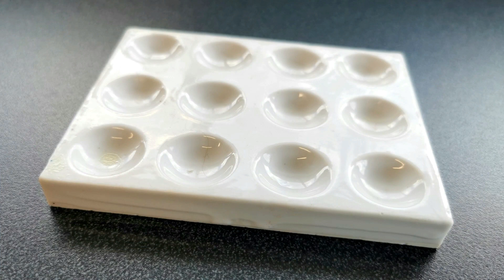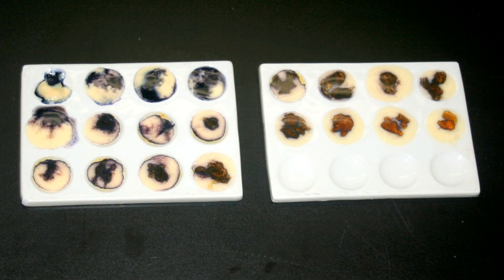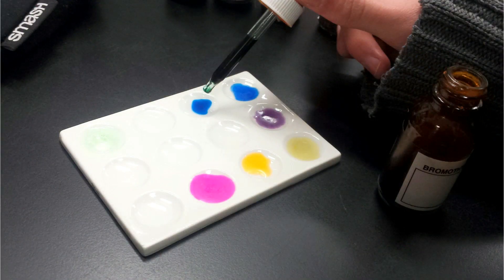Here is a spotting tile, used for putting small amounts of liquid or solution. In this case it was custard from a student's mouth — after spitting out a little bit of custard at 30-second intervals, they added iodine solution. At the top left you get the iodine-starch dark blue or blackish color forming, but toward the lower right you just get the brown from the iodine, because the starch was broken down in the mouth. A bit of a gross use of a spotting tile.